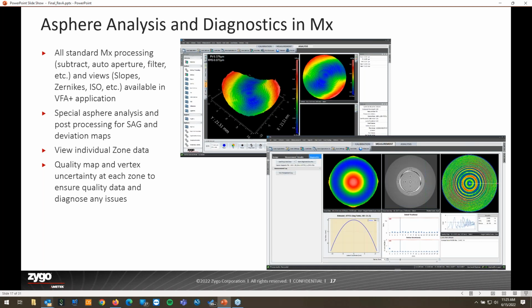You can also identify if there's an excess of vibration that may have presented itself in the measurement if someone bumped the instrument, or if there are data quality issues with dropouts, so that you can know exactly where it is and if it's a good idea to remeasure at that point. So it just gives you a secondary assurance that the quality of your data is exactly, that you're measuring exactly as the result is being pushed out.